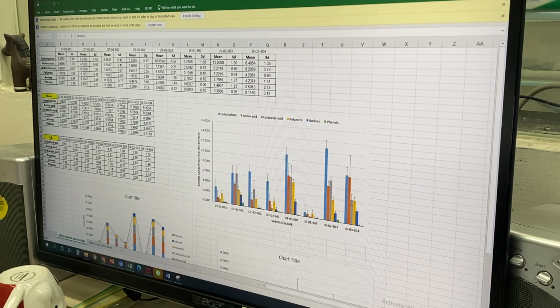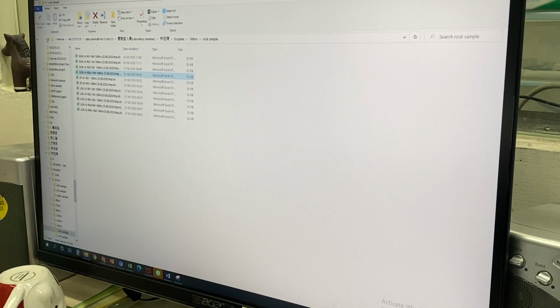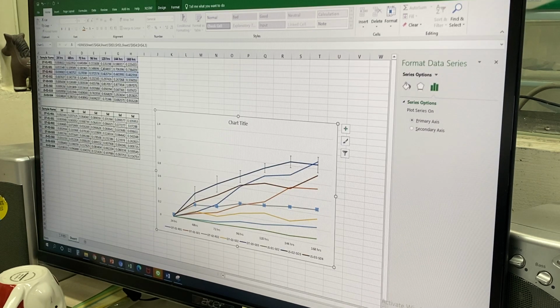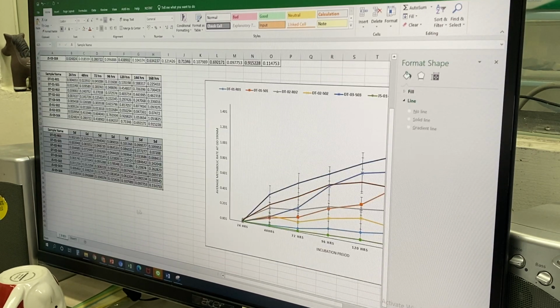How you calculate? I think he has another folder, but I cannot understand this.